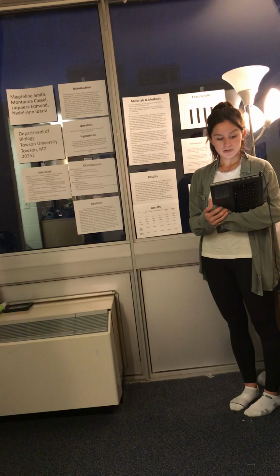This was also one of the goals of our experiment, and in order to discover the optimal level of enzyme activity with trypsin, the catalyzed enzyme, and azocasein, the substrate, my group used a range of different salt concentrations, also known as our buffers, between 0.0 NaCl to 4.8 NaCl.